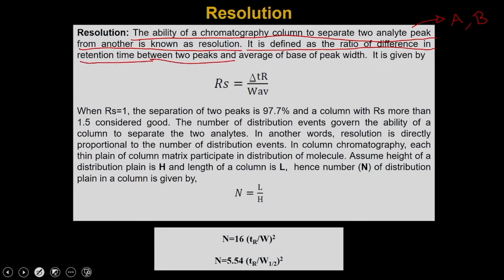between the two peaks and the average of the base of the peak width, which means the resolution is directly proportional to the difference of the retention time between the two peaks, and it is inversely proportional to the average of the base of the peak width.